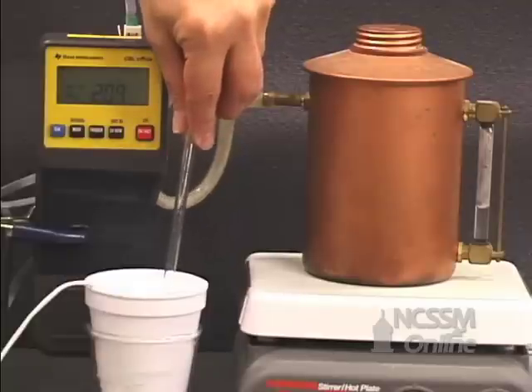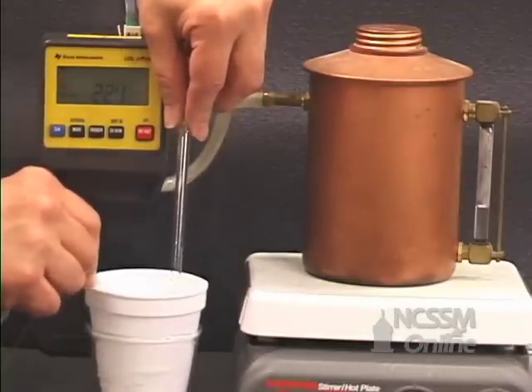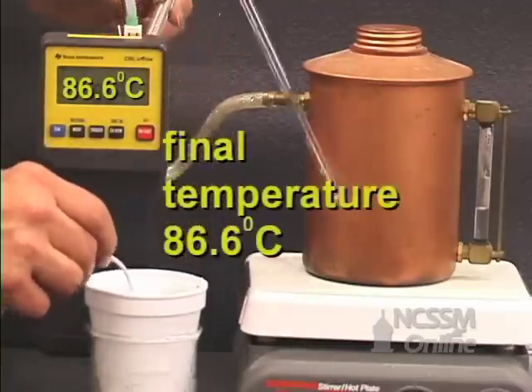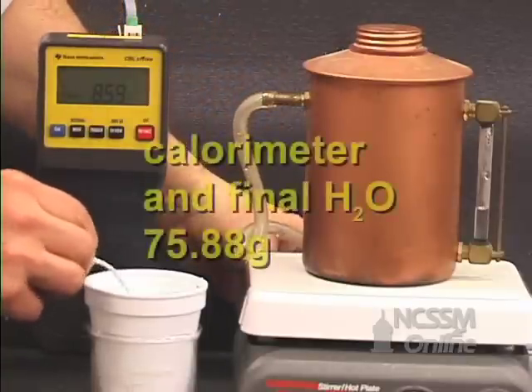The water will condense to a liquid and transfer the energy to the water in the calorimeter. We'll record the final temperature, then let the calorimeter cool to room temperature and remass it to determine the final mass of the water in the calorimeter.